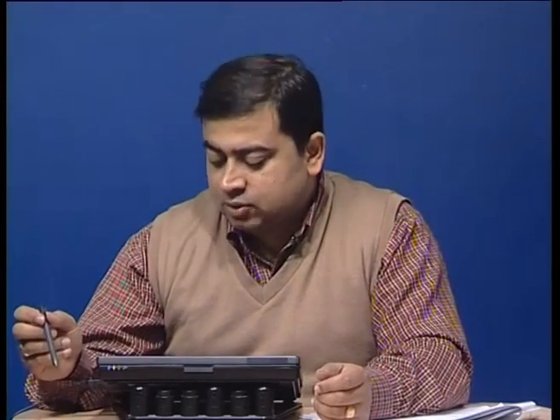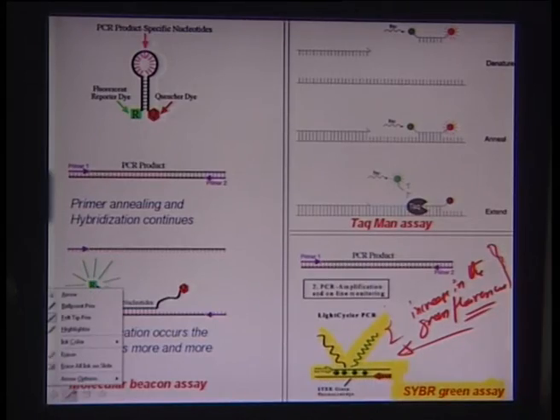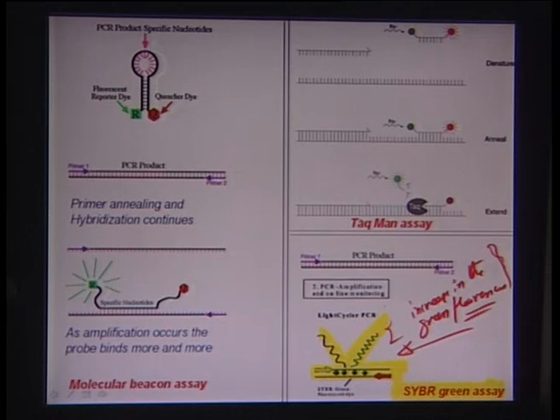So the cleanliness of a PCR process, in terms of what you are amplifying or what remains after this rigorous thermal cycling step, in combination with a protocol like intercalation, might make a difference and might give you a good estimate of the fluorescence growth. The second very useful technique, used to satisfy this necessary condition of specificity that techniques like intercalation lack, is the TaqMan assay.